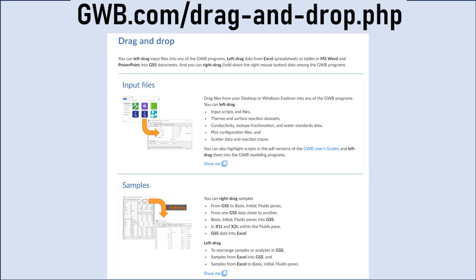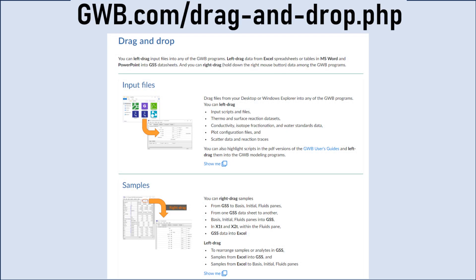The drag-and-drop feature allows you to easily move data into, within, or between GWB applications.